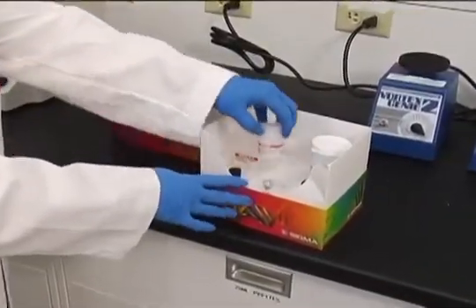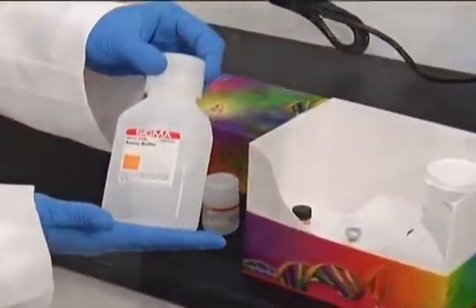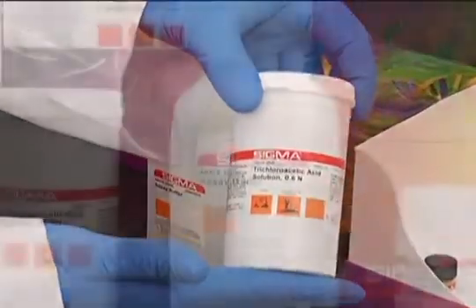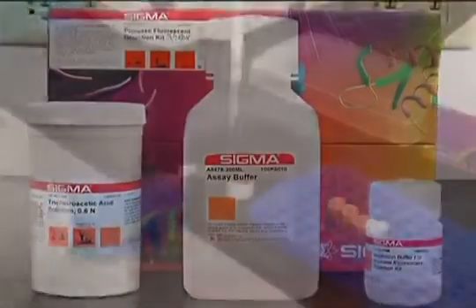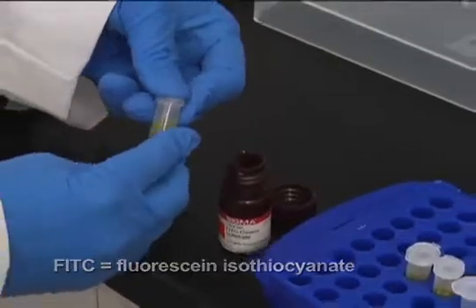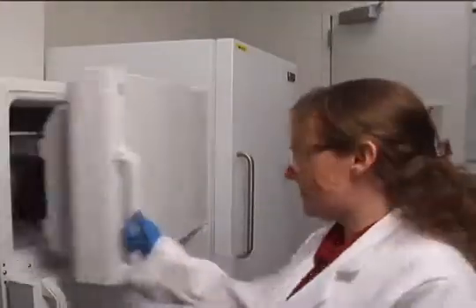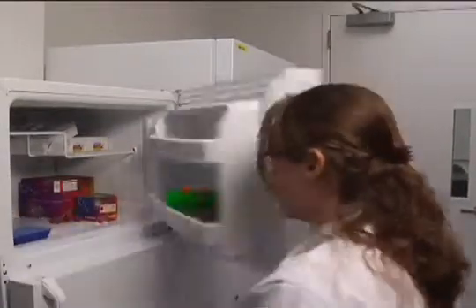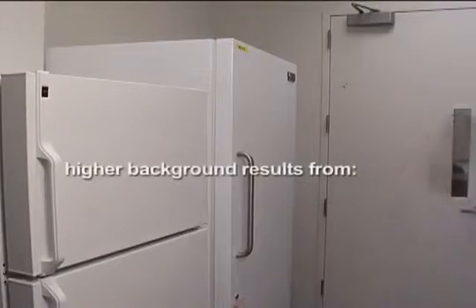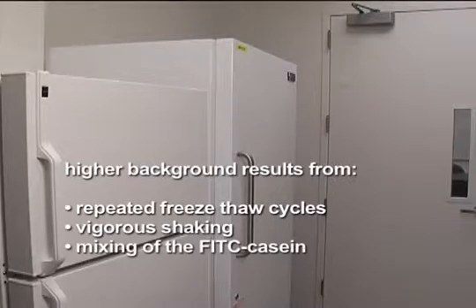For this procedure, the incubation buffer, assay buffer, and 0.6 normal trichloroacetic acid, or TCA solution, are provided as ready-to-use solutions. Aliquot the solution of FITC-labeled casein into smaller volumes and store at -20 degrees Celsius, making sure to protect from light by using amber vials or wrapping clear tubes in foil. Aliquoting the FITC casein substrate minimizes the need for repeated freeze-thaw cycles. Repeated freeze-thaw cycles, or vigorous shaking or mixing of the FITC casein, could lead to separation of the FITC from the casein, resulting in higher background.